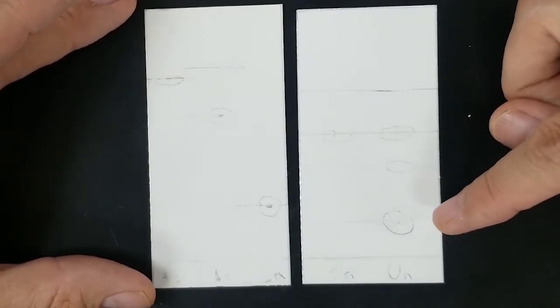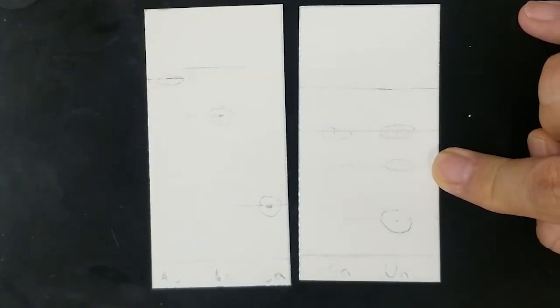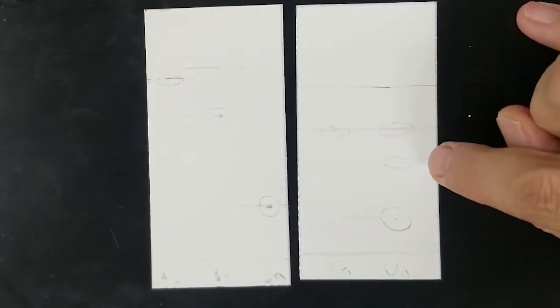There also is the possibility that we might have an impurity. So I'm thinking that this one here is an impurity. On the UV plate, it was actually really, really faint. So I'm betting it's probably an impurity. If the RF of that spot does not line up to any of the other ones, it's an impurity. Okay. Before we end it here, I did want to show you there is one alternative way of doing plates here. So let's go ahead and go back to the fume hood.